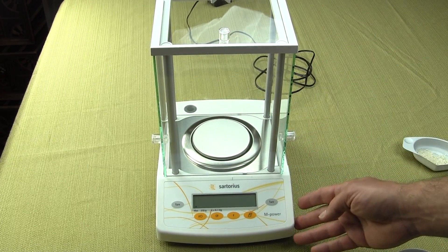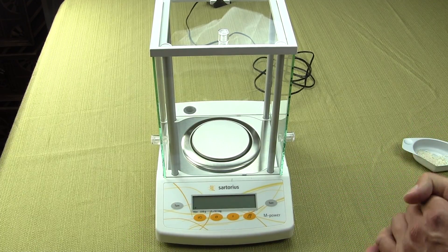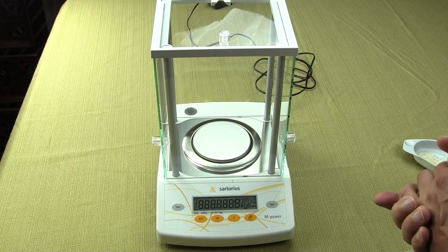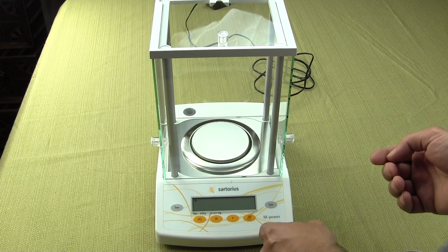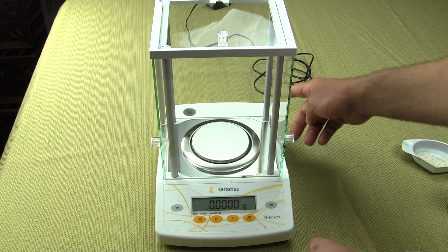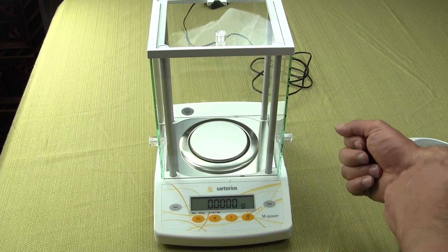You do have a small footprint. This balance is pretty small altogether dimension-wise. So in your laboratory, if you are limited with space, the overall dimensions would be 7.4 inches by 9.8 inches in depth, and the total height would be 11.7.